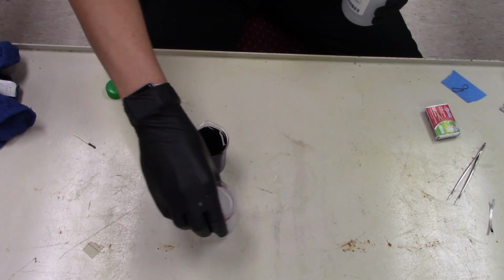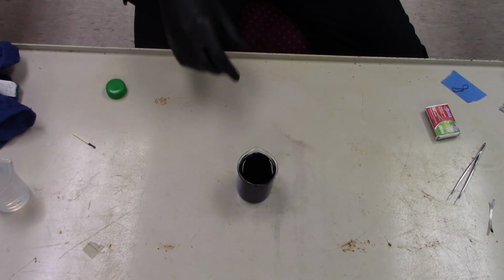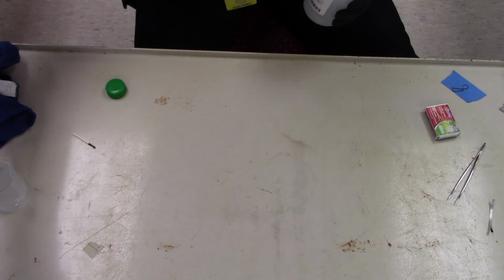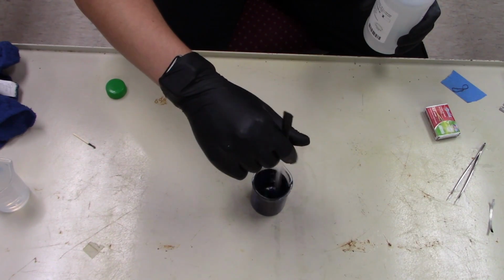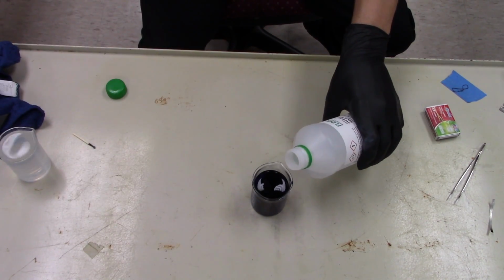Now this one is a little bit neater. I got to be kind of careful with it because, come to think of it, I'm going to dump a little bit of it out. So we're just going to forget that ever happened because I'm not going to use it. Okay, so let's get this stirring. And look at this carefully because it's kind of cool. I'll add a tiny bit of acid to it.